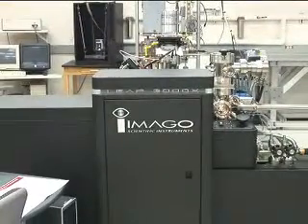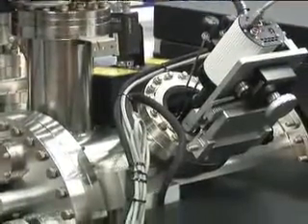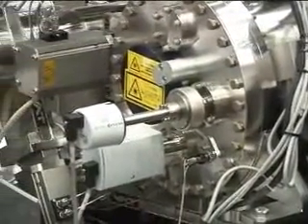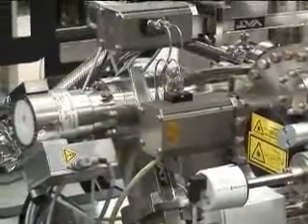academic institutions. The LEAP is capable of gathering data from materials samples at a scale previously unheard of, producing 3D images of materials at the level of their individual atoms. Yet that unprecedented level of detail brings challenges of its own.